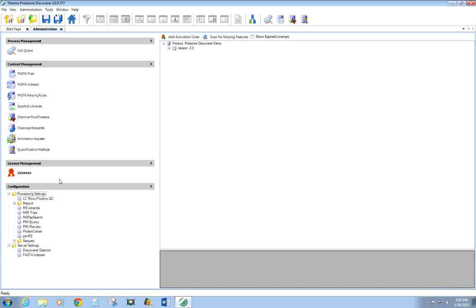Below that, here's where we configure things. So a lot of times people want to change things. What's going on behind the workflow, and this is where you would get in here and take a look. We'll ignore this because this will not be available in the commercial release.